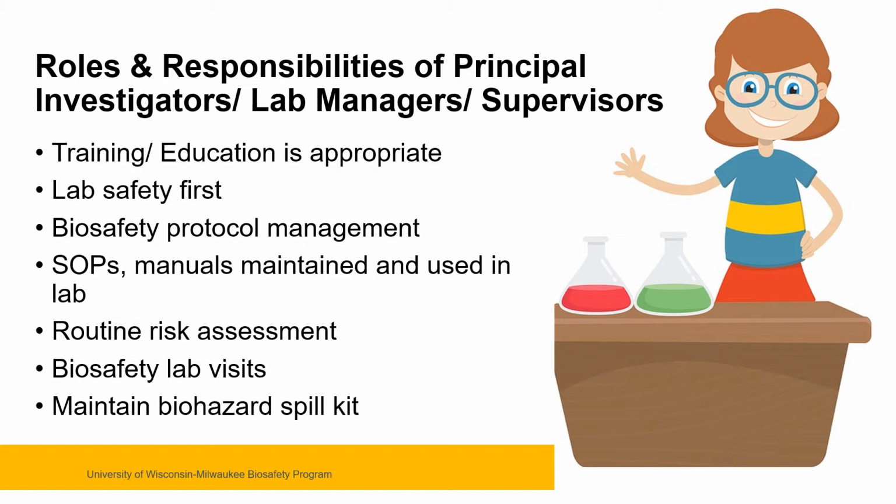The following are the roles and responsibilities of principal investigators, laboratory managers, and supervisors in laboratories handling biohazardous materials. It is required that you possess the appropriate training and education to handle the biological materials being handled in your lab. It is your responsibility to ensure the laboratory is safe, organized, and personnel are appropriately trained and educated in the work they are performing.